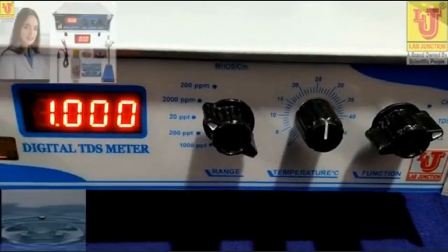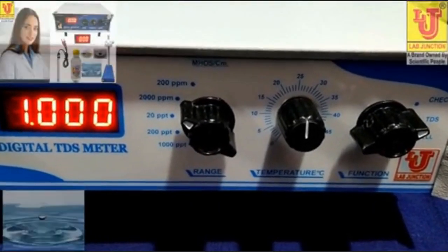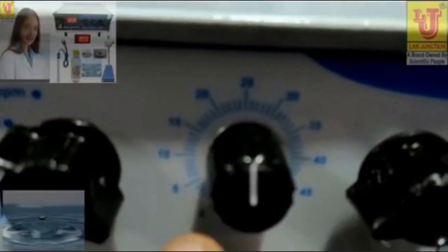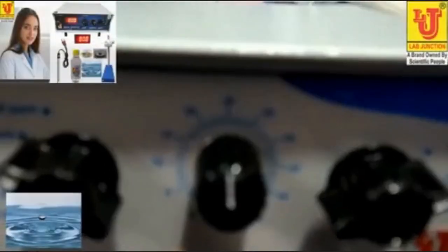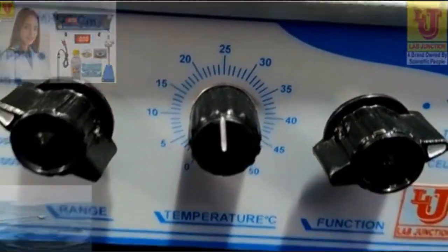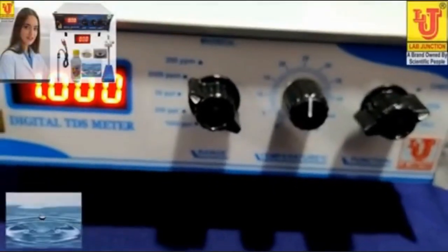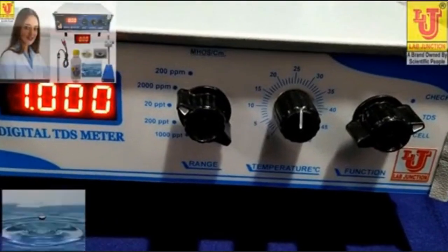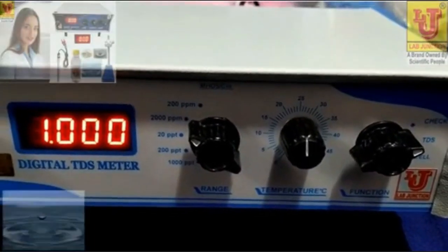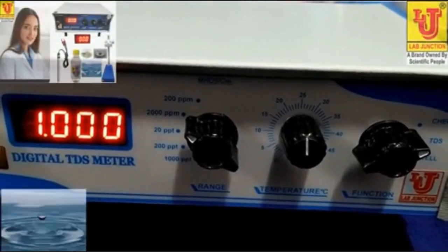Now set your ambient temperature from the temperature control. If you don't know your current ambient temperature, then set to default value 25 degree. If you have your own ambient temperature value, then insert your own temperature value. If you don't know, use standardized value of 25 degrees centigrade.